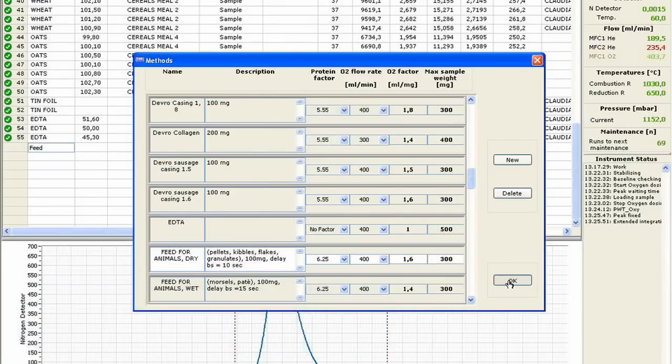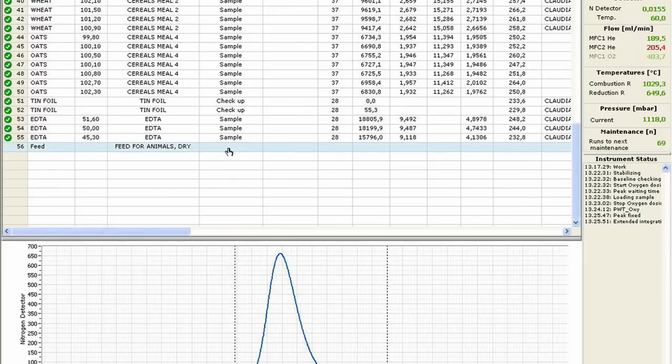The fully automated NDA 701 is entirely controlled via PC through the intuitive Dumasoft software.